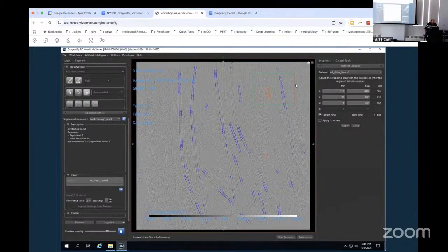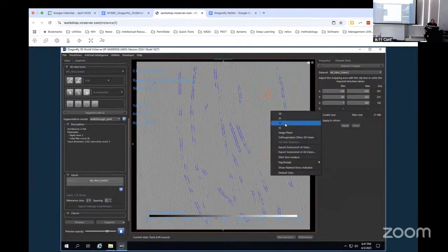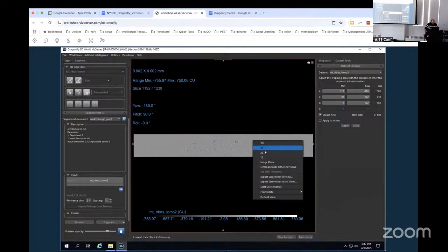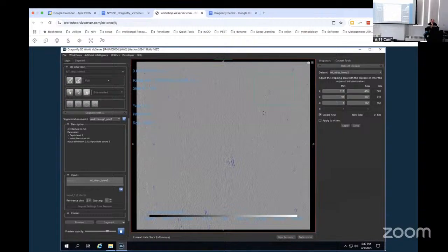Maybe we can just use the whole thing. Let me take a look at it real quick. Oh, hey, it's working. Yeah, let's not do a whole slice. This is also being very weird. Everyone have a crop box drawn?